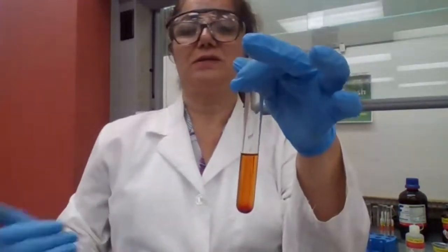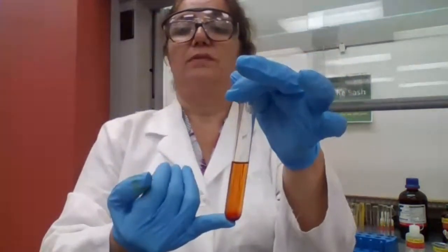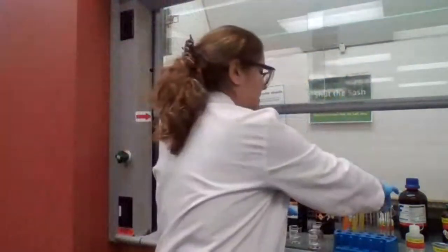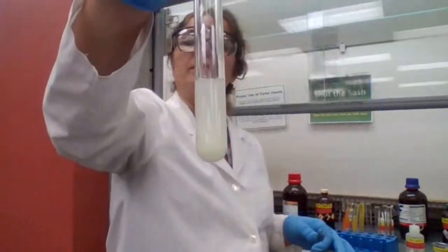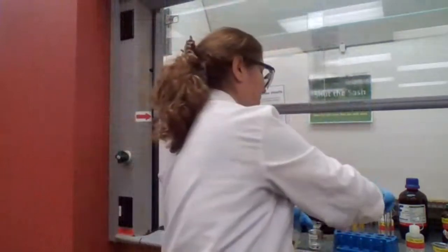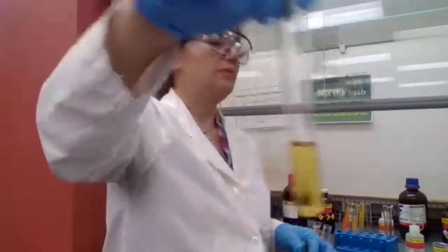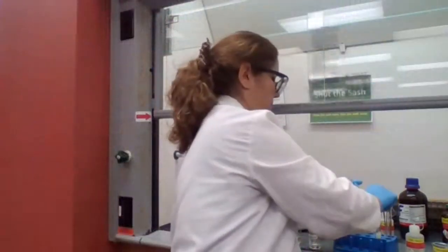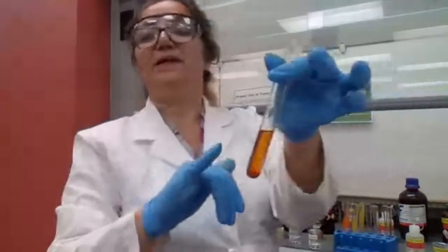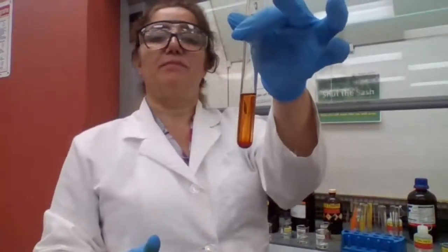I used acetone because I know acetone is, this one is acetophenone. This is acetophenone. Acetone is this one. Acetone. And cyclohexanone. I'm waiting for the result for acetophenone. I'm going to let it stand, come back to it at the end of the lab.